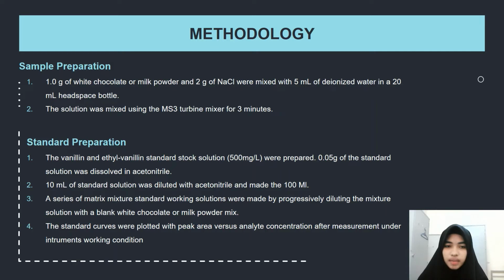Assalamualaikum, my name is Na'alibah binti Azizi and I will explain about methodology. So for the sample preparations, 1.0 gram of white chocolate and 2 gram of sodium chloride were mixed with 5 ml of deionized water in a 20 ml headspace bottle. The solution was mixed using the MS3 turbine mixer for 3 minutes.